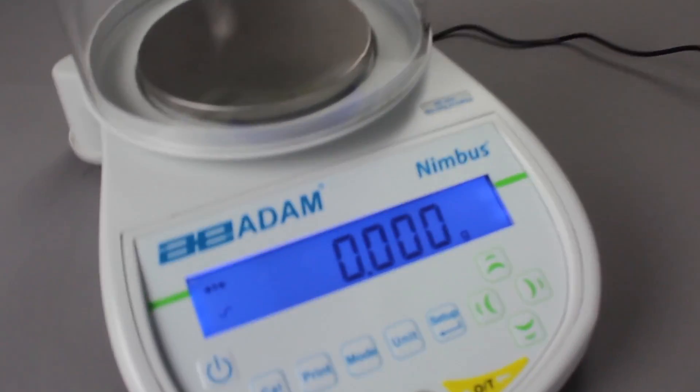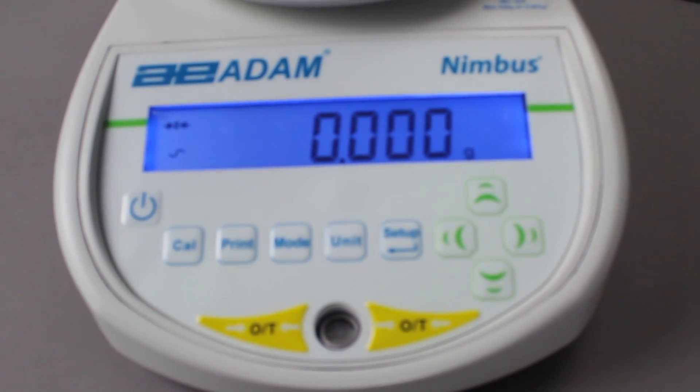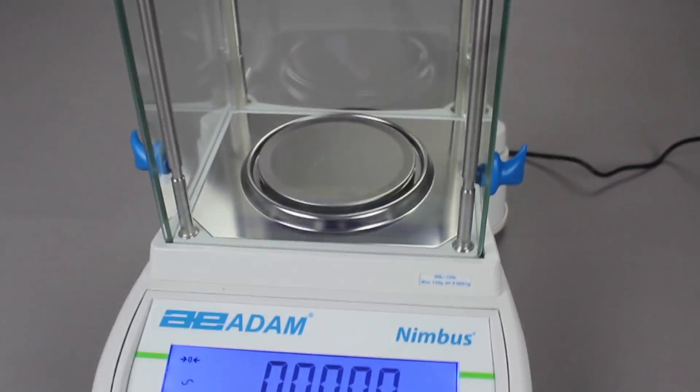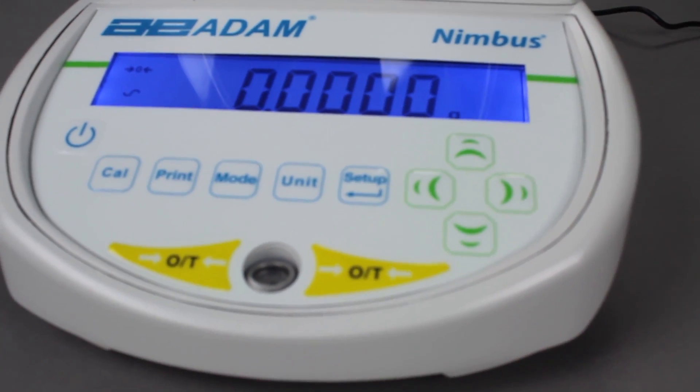Adam's Nimbus balances deliver sky-high performance with down-to-earth value. The Nimbus offers analytical and precision models with a compact footprint and intuitive user interface.